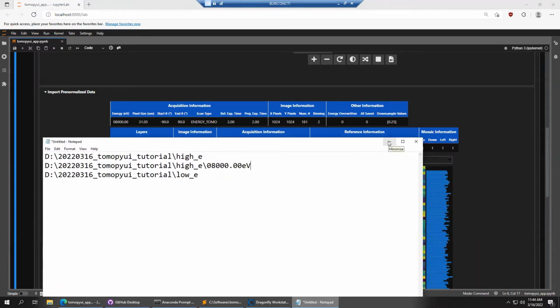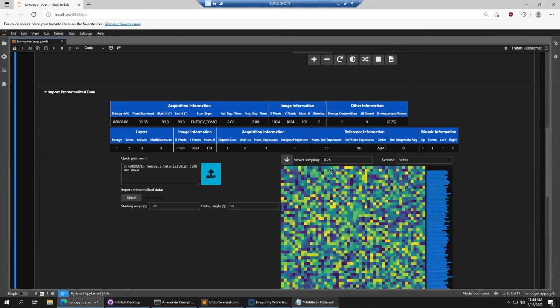Along the way, it's saving all of this metadata about your data. I'm going to clean this up eventually, but this is the first part of the process. So this is the raw data, this raw metadata. Once it's normalized it, there's some other information that you can get.